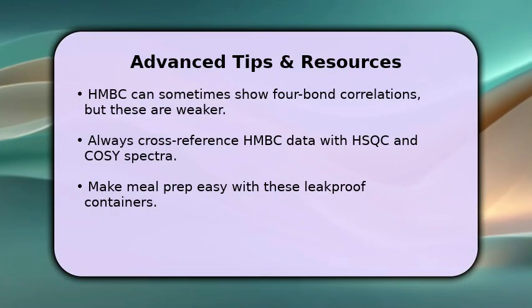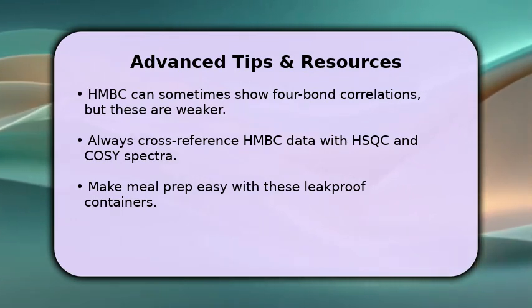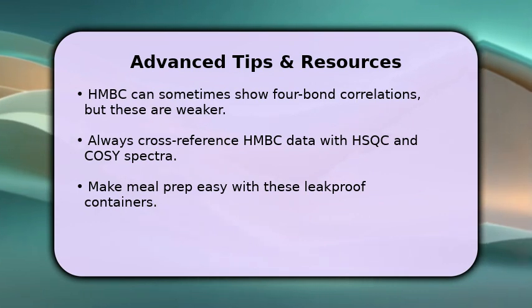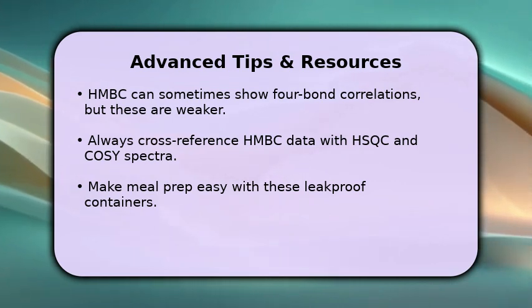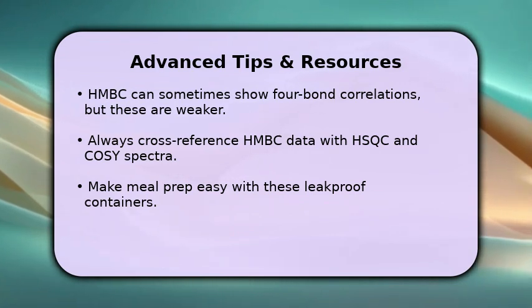While HMBC primarily shows 2 and 3 bond correlations, you might occasionally observe weaker 4-bond correlations. Always cross-reference your HMBC data with other two-dimensional NMR experiments like HSQC and COSY for a comprehensive structural assignment. This multi-technique approach ensures accuracy and confidence in your results.